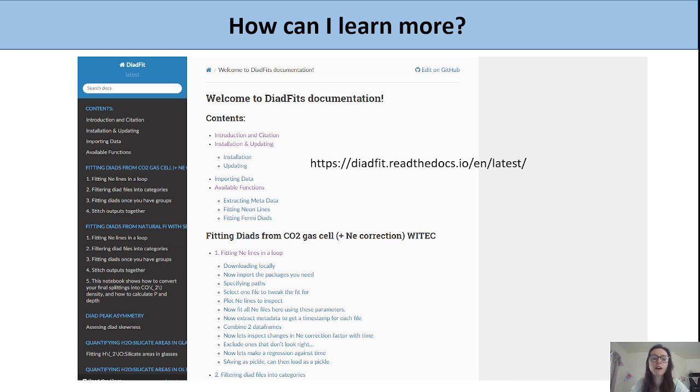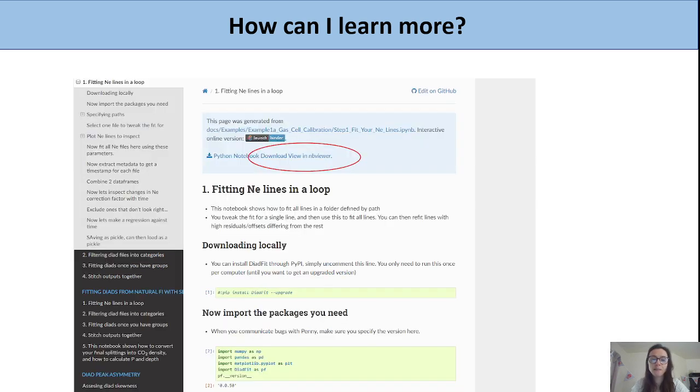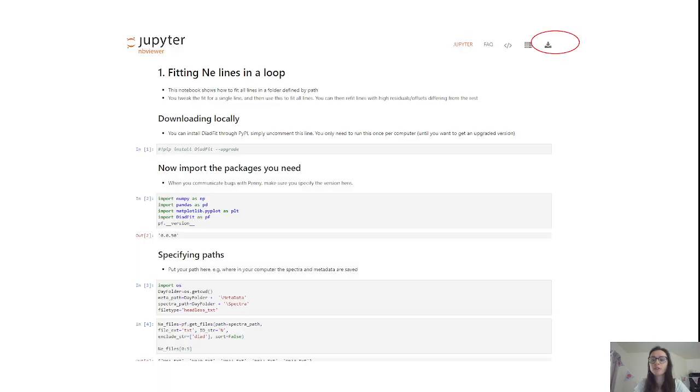For any workflow you're interested in, you can click on it and you'll get a Jupyter notebook. You can either read through this or click the download view in NB viewer button. This will launch it and you'll see a little download button on the right-hand side. You can download that and then you have the notebook which you can run on your computer and use to fit your spectra.